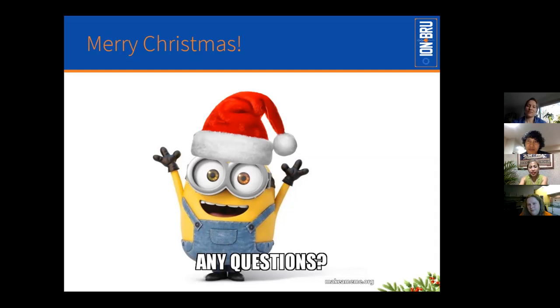Yeah, my next question would be, I always ask this question to the Nanopore people, because so far the people that I ask lately don't have the answer. I guess the main issue with the MinION platform is the accuracy or the errors of the reads. Compared to Illumina, of course, with Illumina you can get higher accuracy. So how can we address those issues in terms of sequencing?